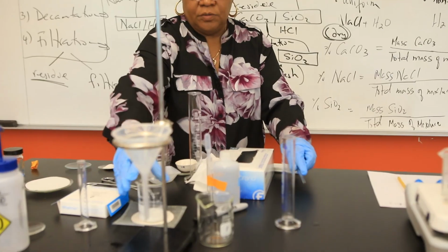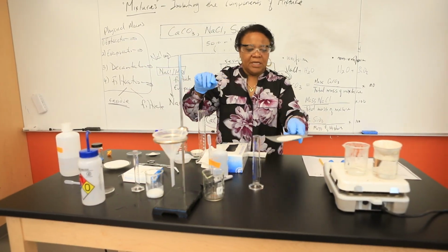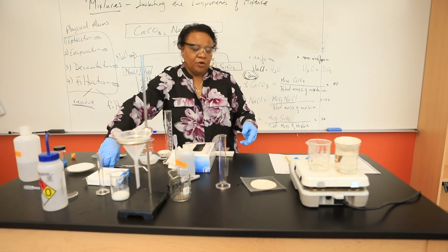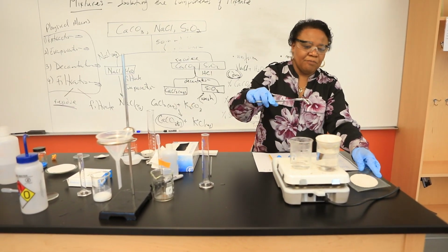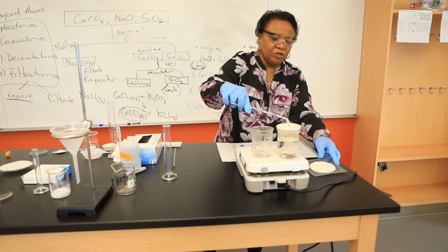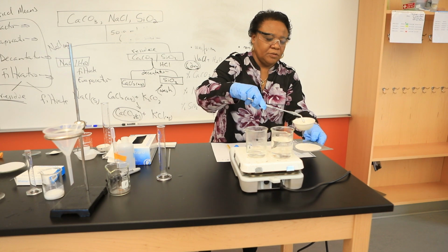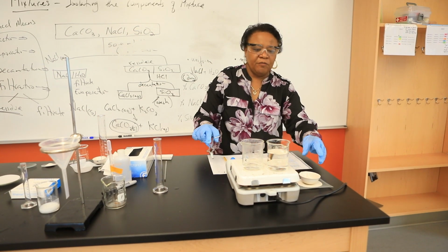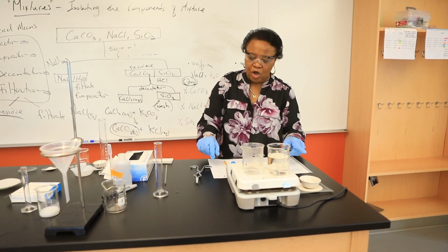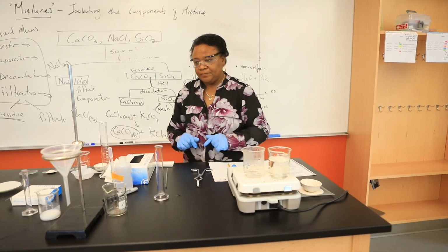So what should I do? It's going to be very important now. Please note, again, that I transfer that hot evaporating dish. So I'm just going to transfer that dish to my wire gauze and allow it to cool. Remember now, if it's hot, that will affect my final mass.